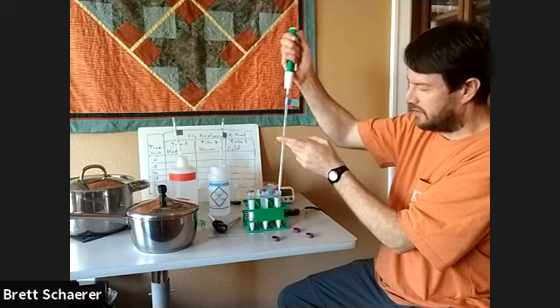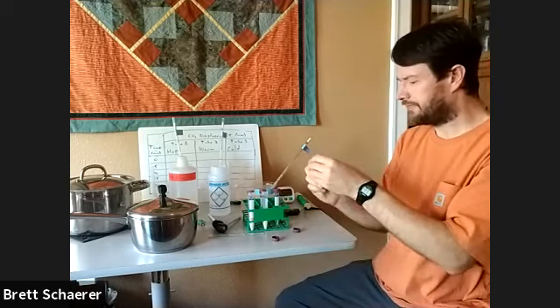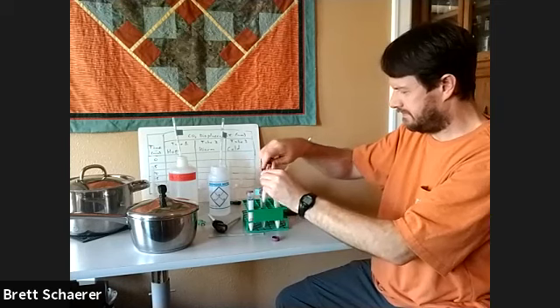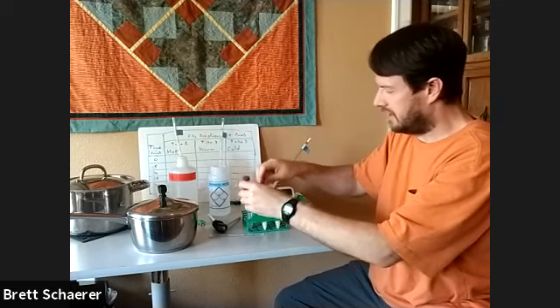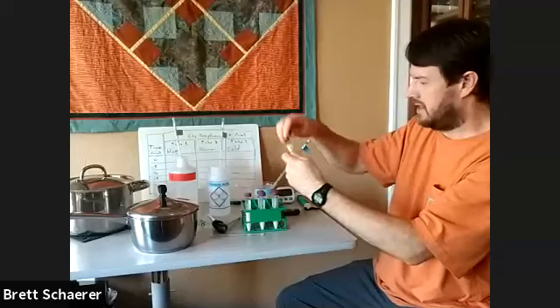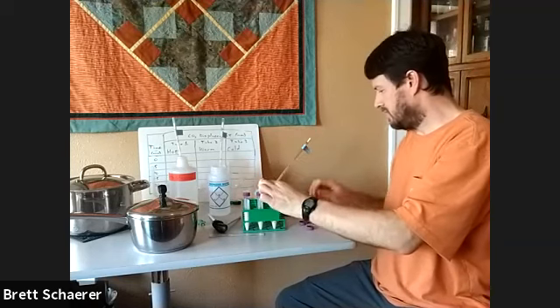The idea here is the only thing that is different between these setups is the temperature. I'm going to seal these really well so they don't spill yeast into these different environments. Okay. And we'll add the glucose. Other tube.